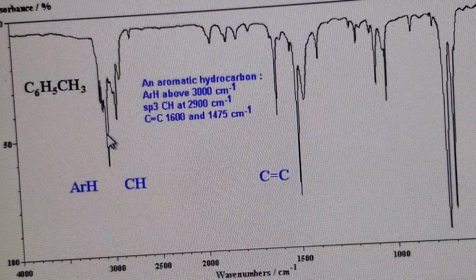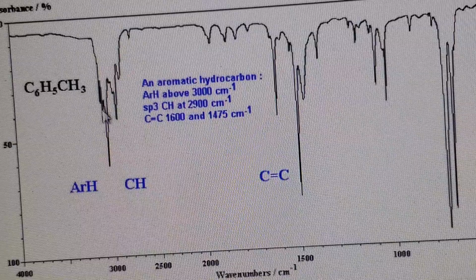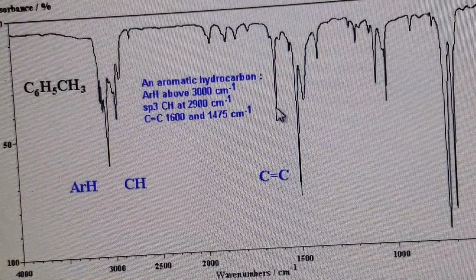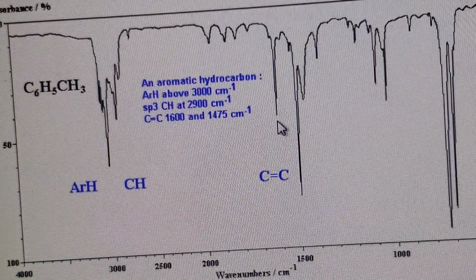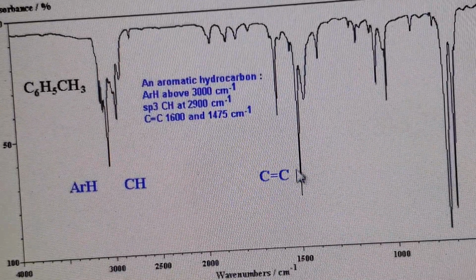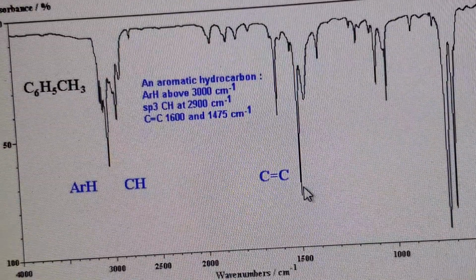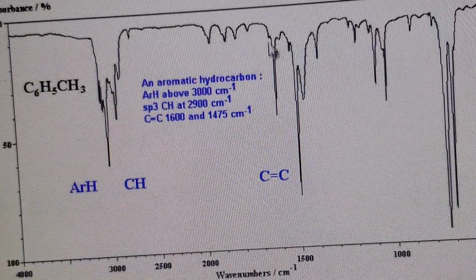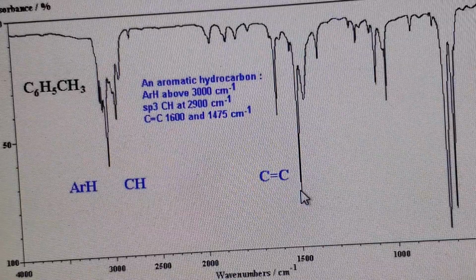Also, you go to the double bond area because you think this is alkene, not alkyne, and you have to confirm. You go here and you find the 1600 signal, right? Because of that, you think this could be alkene, but you have a couple of others, and this is quite tall, so it may not be the regular bending vibration. As you can see, the general bending vibrations are small, so we assume this is from the real sample.